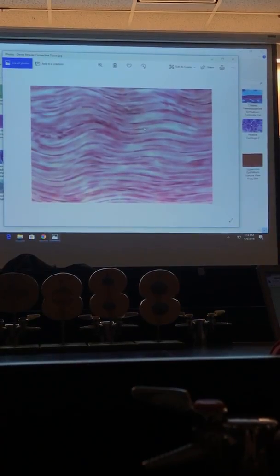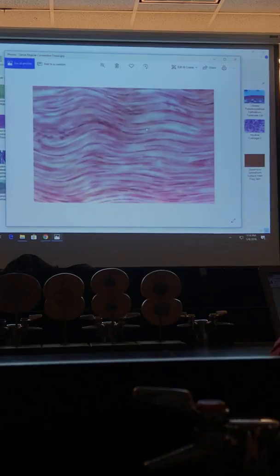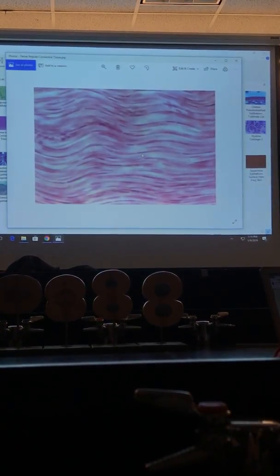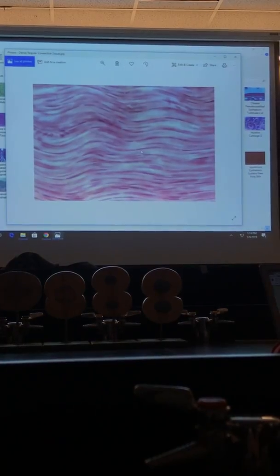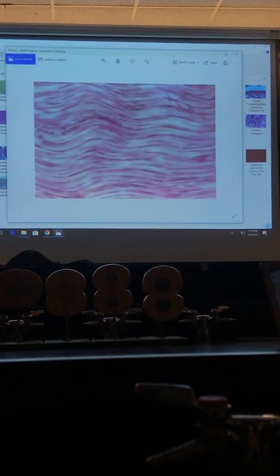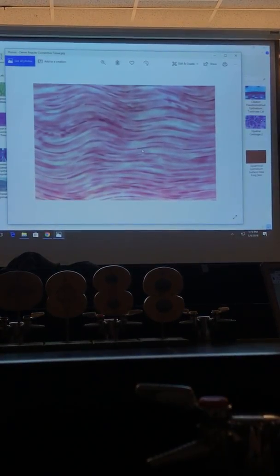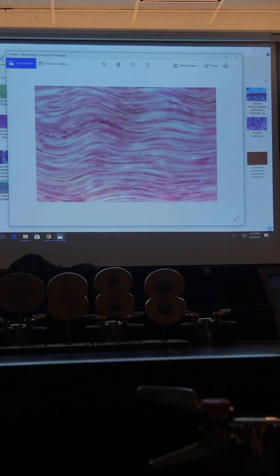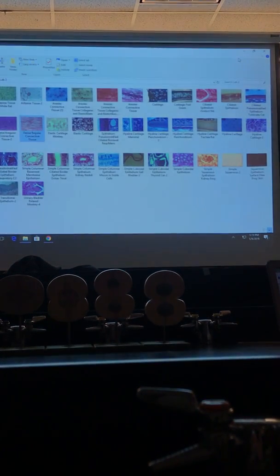So in your slides, they can be yellow or white, so don't memorize color. Alrighty, this one, if I use it, is pink, acid stain. Yours can be yellow or white based upon the amount of elastic fiber or elastin protein. Alright, that makes sense? That shouldn't be hard, but when you're adding all this stuff, I know, it becomes intolerable. So yellow or white fibers, connective tissue, and this are examples of DRCT.